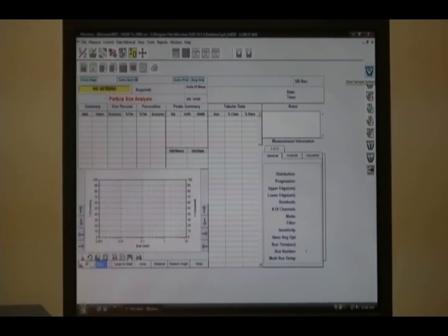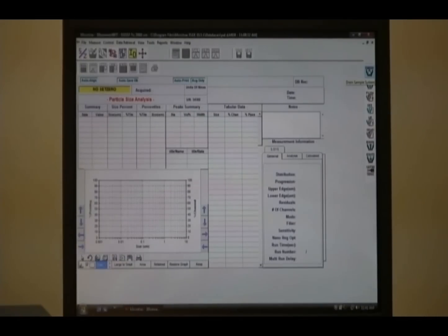The first step in cleaning the cell is to drain the system. We'll drain the system and make sure there's no fluid left. If there's any question about this, you can tell by looking into the circulator bowl and seeing that it's empty. If you're using a solvent, it's necessary to return the system to water. To drain the system, merely move the cursor to the drain icon and the drain begins.